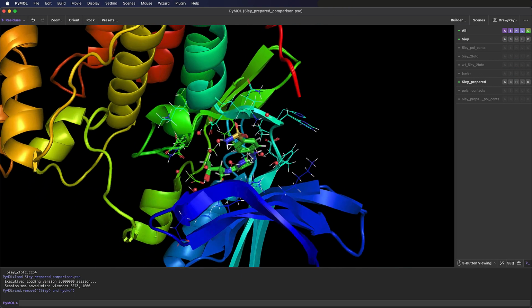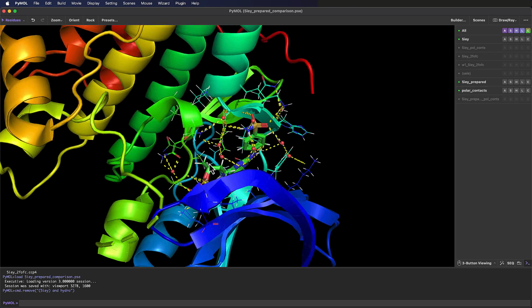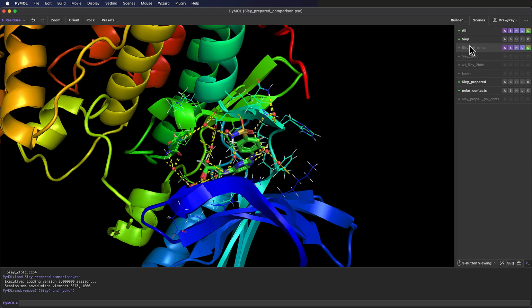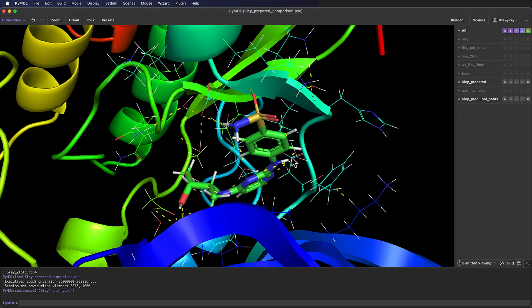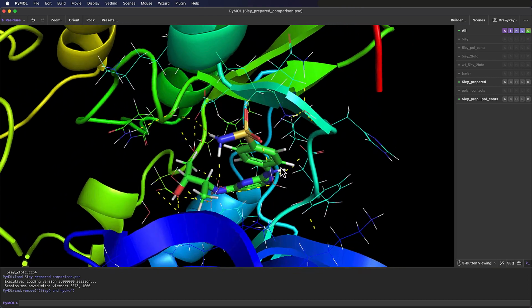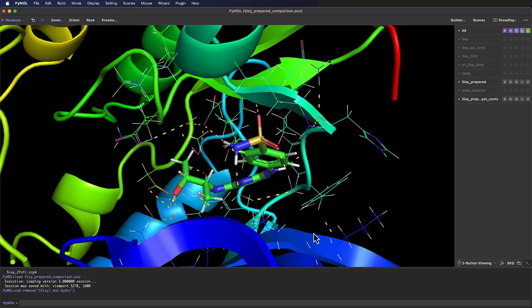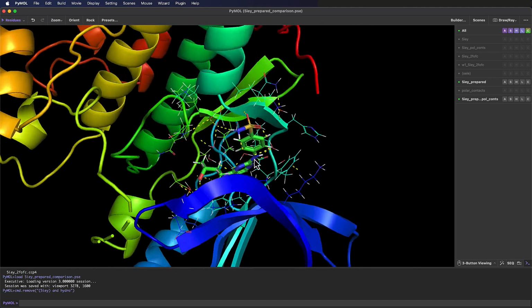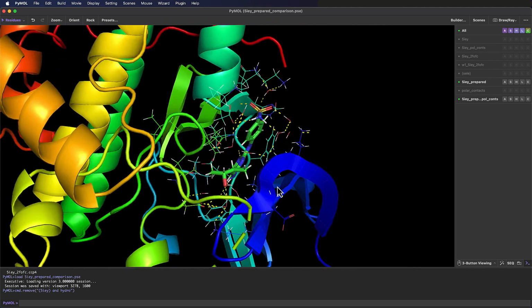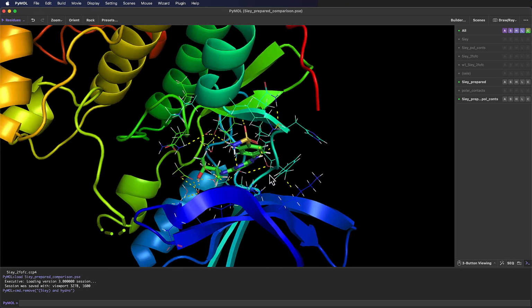In the previous video, we applied the ligand sites cartoon preset, and we can see there are lots of polar interactions here. This looks pretty busy, and it would be useful to only highlight the interactions between the inhibitor of the CDK2 protein, and to ensure that there are no missing hidden interacting atoms or incomplete water molecules like we have with this preset. Although presets can be useful, we're going to focus on how to create binding pocket selections, apply styles, and display interactions without using a preset.